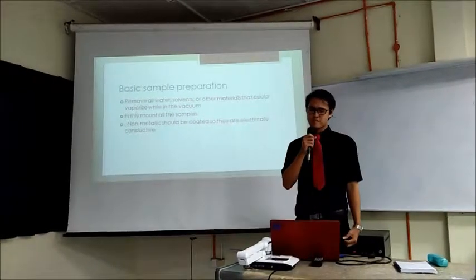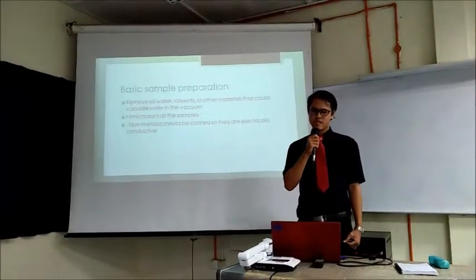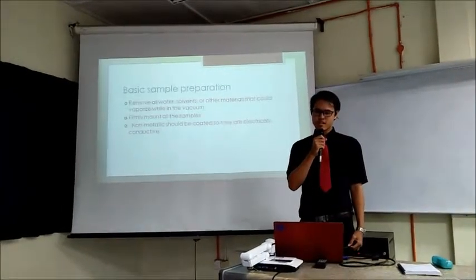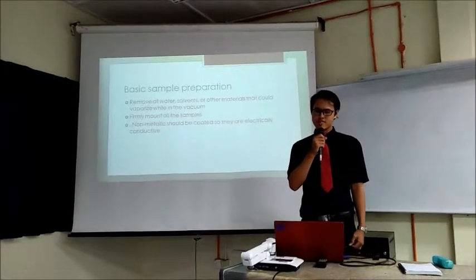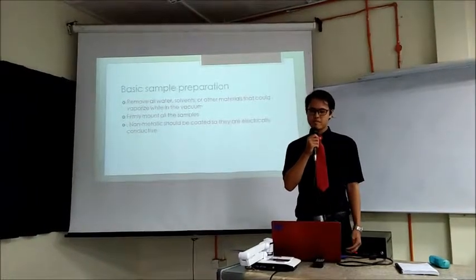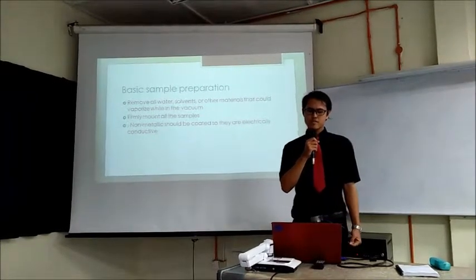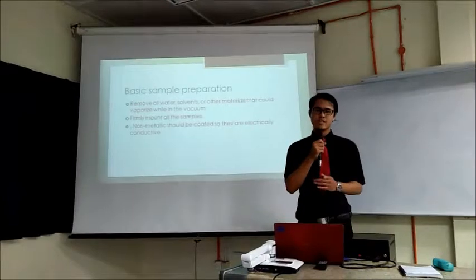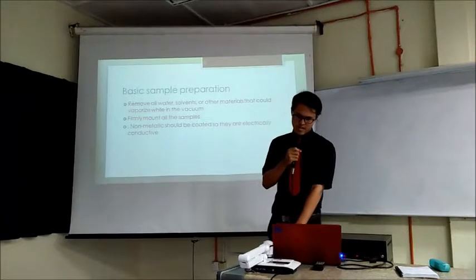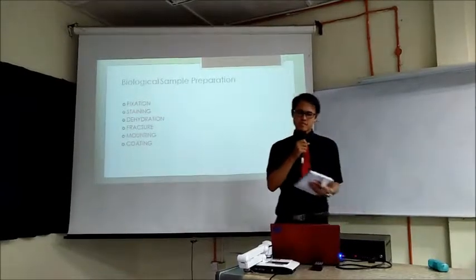Next is basic sample preparation. This is needed for all the samples for analysis. First of all, the samples need to have water, solvent and other materials that could vaporize in the vacuum removed. Second is to firmly mount all the samples to the sample holder, and the third one is non-metallic samples should be coated so they are electrically conductive and can emit signals uniformly.